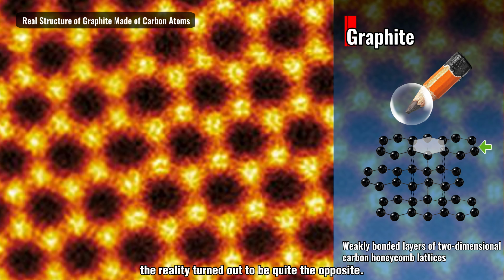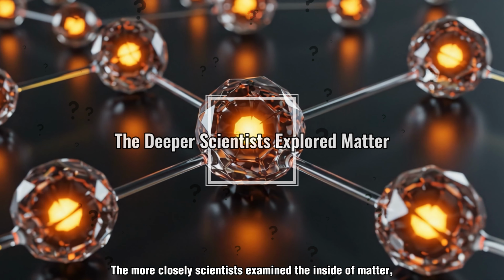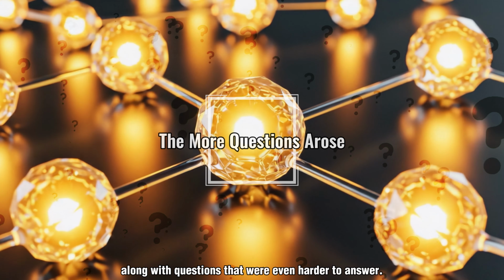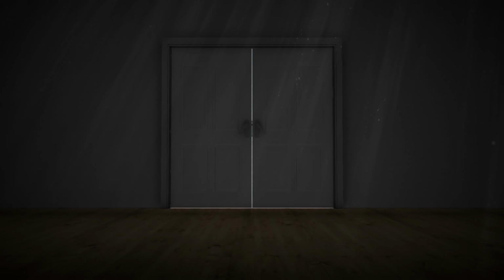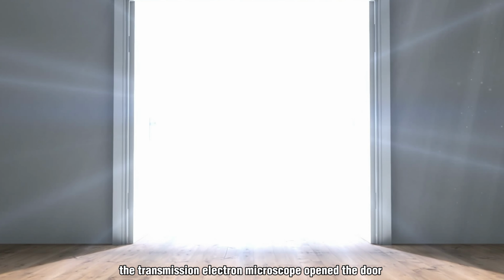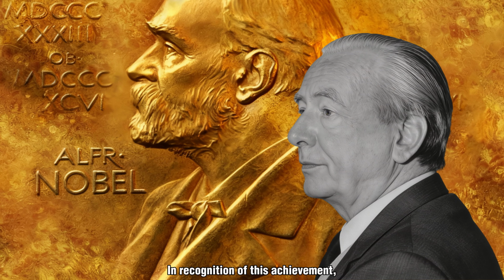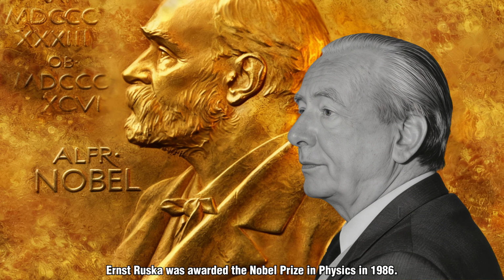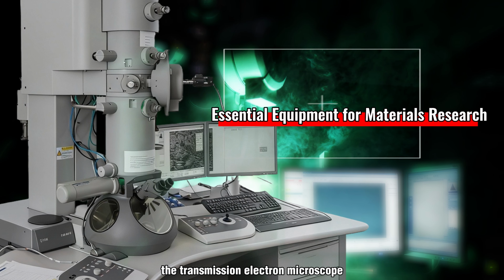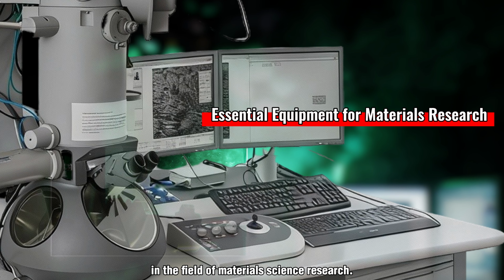But as time passed, the reality turned out to be quite the opposite. The more closely scientists examined the inside of matter, the more unexpected phenomena appeared, along with questions that were even harder to answer. Rather than marking the end of research, the transmission electron microscope opened the door to an entirely new era of scientific exploration. In recognition of this achievement, Ernst Ruska was awarded the Nobel Prize in Physics in 1986, and today, the transmission electron microscope has become an essential instrument in the field of material science research.